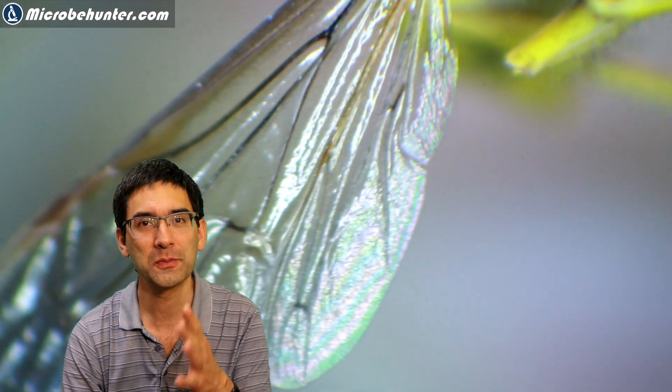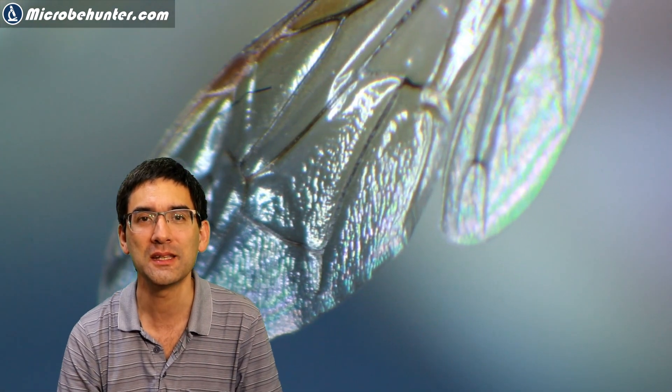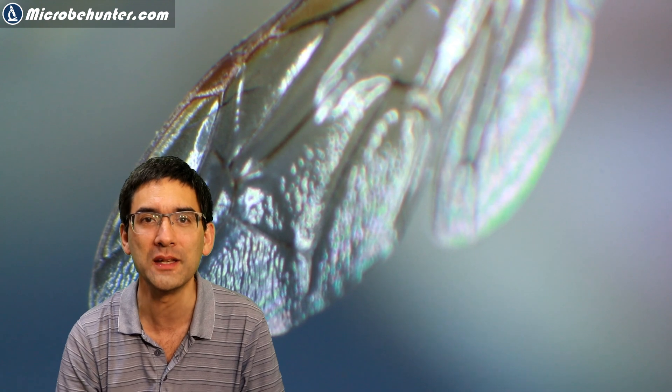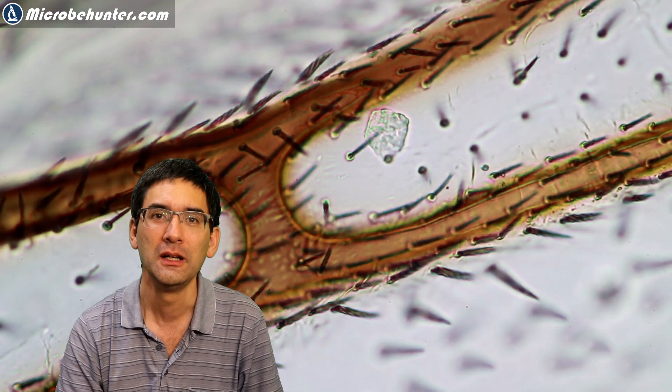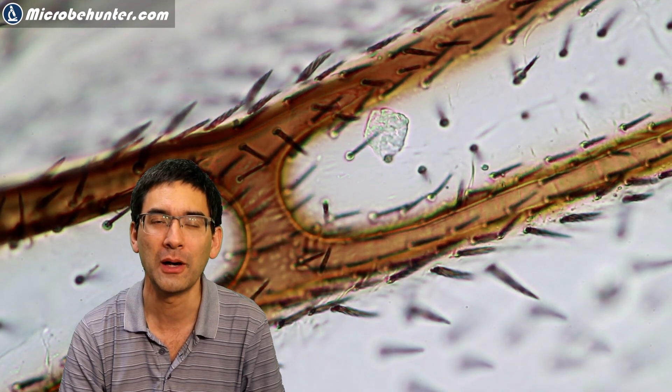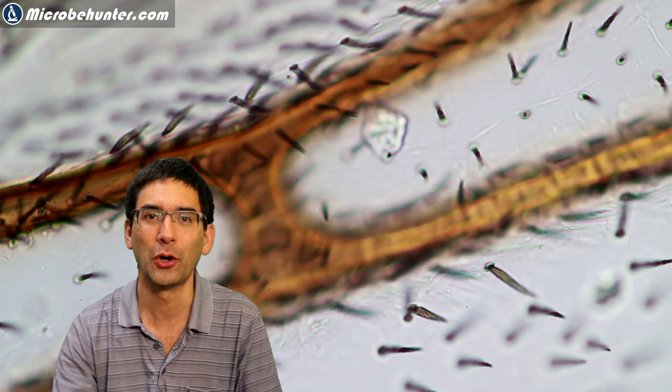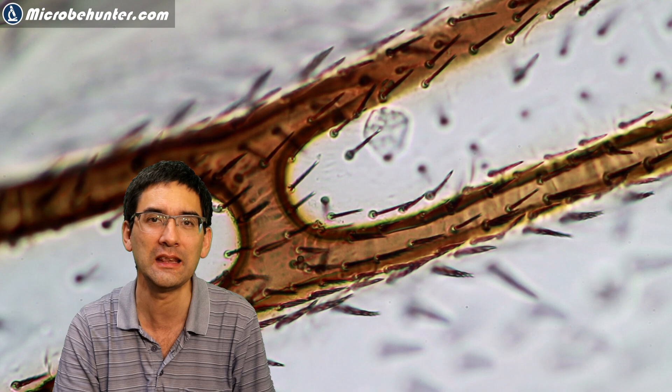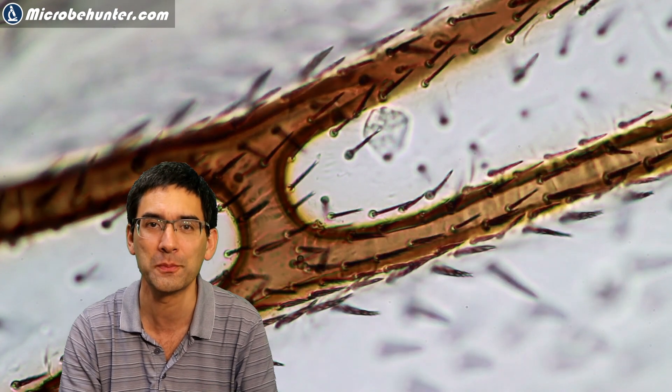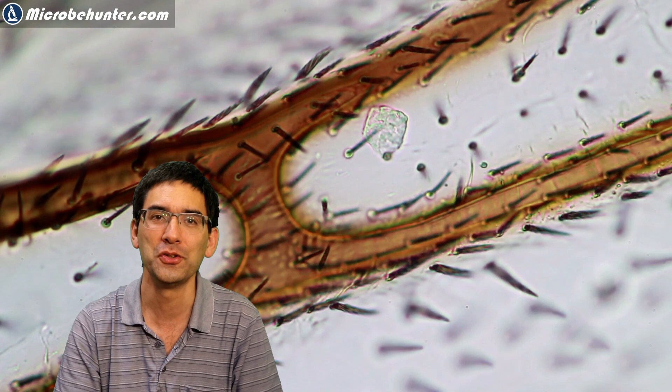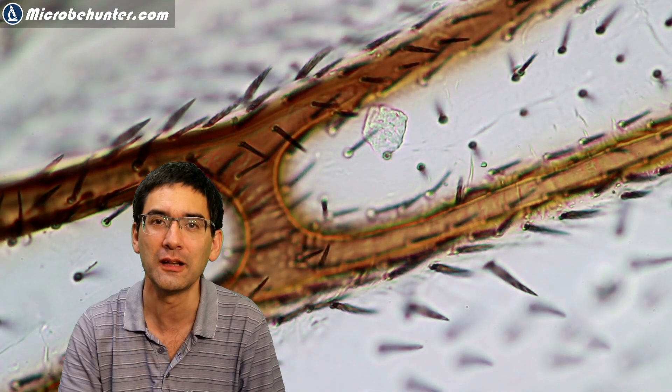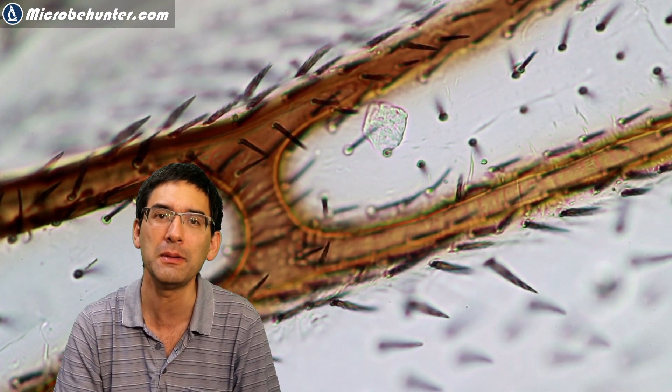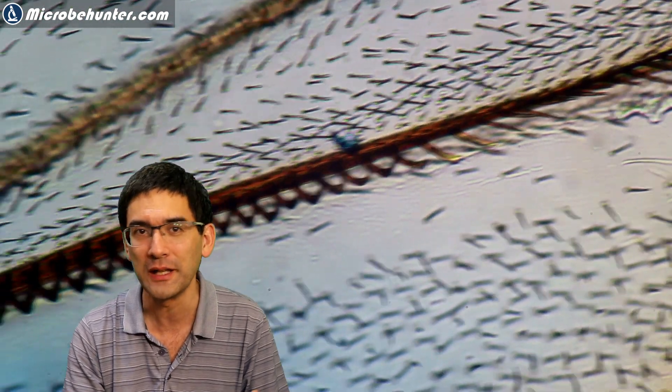And of course, the wing. Wasps belong to the so-called Hymenoptera. And this means is that they have two pairs of wings, the front wings are larger and then also the hind wings, which are a little bit smaller. And here I put them now under the compound microscope. And those dark, thick things that you see there, these are vessels. And I think they might also give the wasp wing its strength and stability. Also interesting to see a lot of tiny little hairs covering the wing. I think this might be important for aerodynamics, I can imagine.